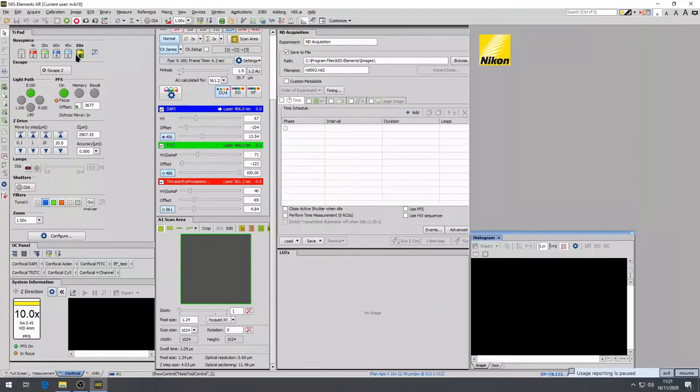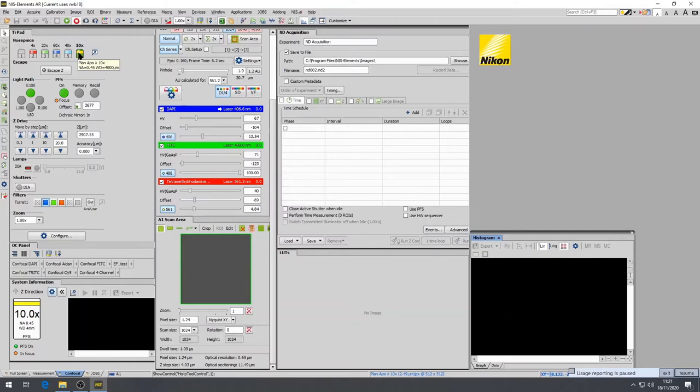To find your sample, first select the appropriate objective. All available lenses are visible in the TI Pad panel and click on the one you wish to use. The microscope will automatically rotate the objective turret into position.